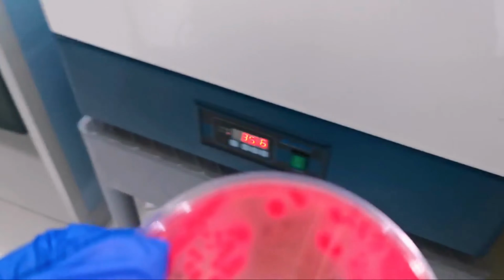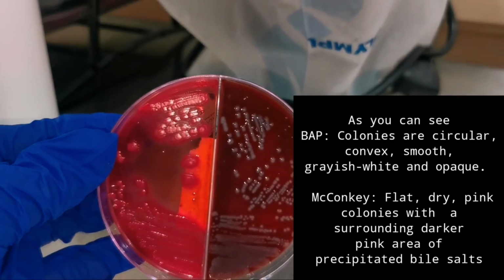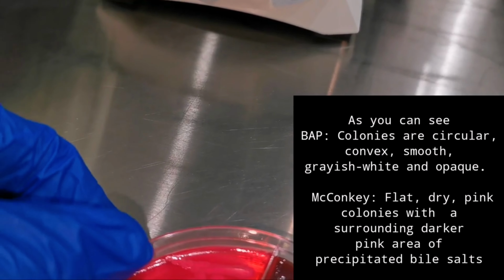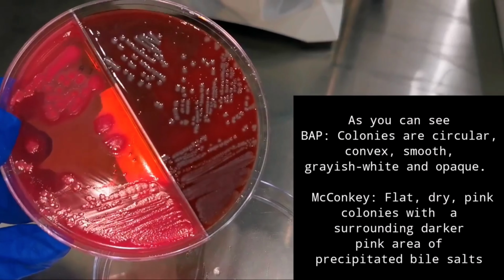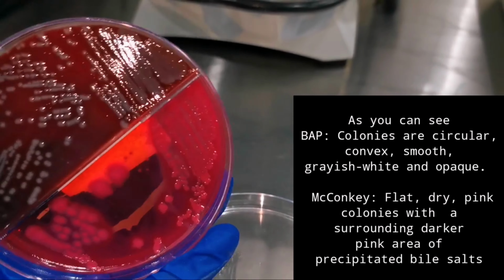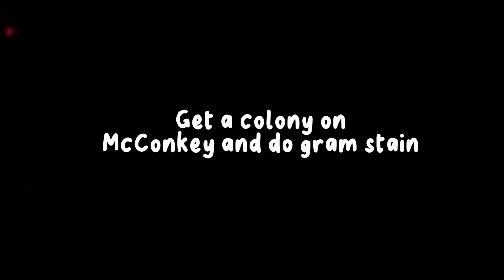As you can see in blood agar plate section, the colonies are circular, convex, smooth, grayish white, and opaque. While on MacConkey agar, the colonies are flat, dry, pink, with a surrounding darker pink area of precipitated bile salts. To further identify the bacteria, we will perform gram stains so that we can observe the bacteria morphology under the microscopy.